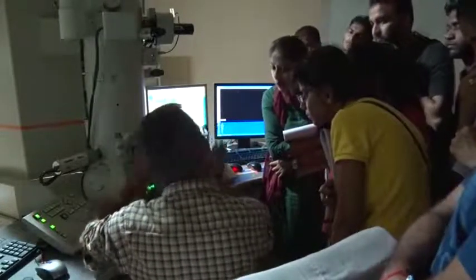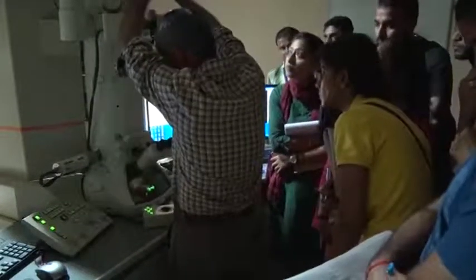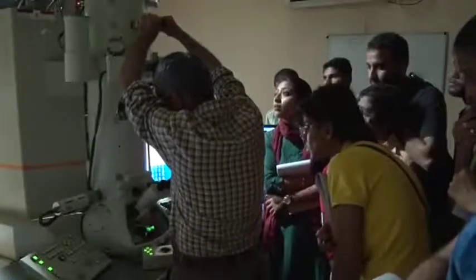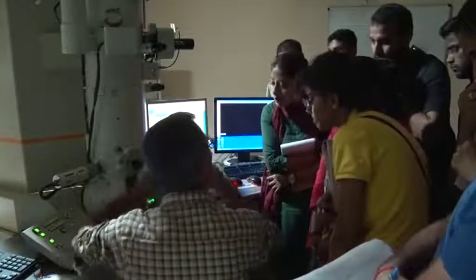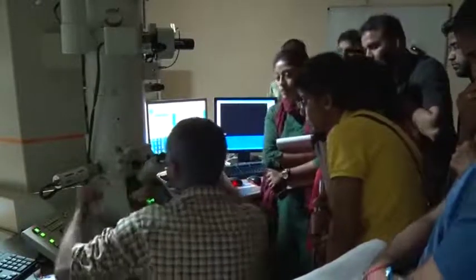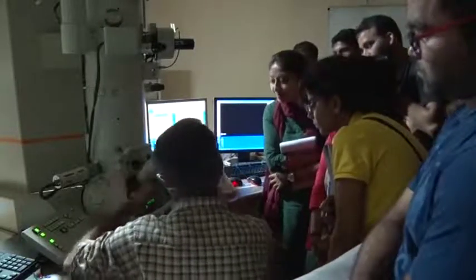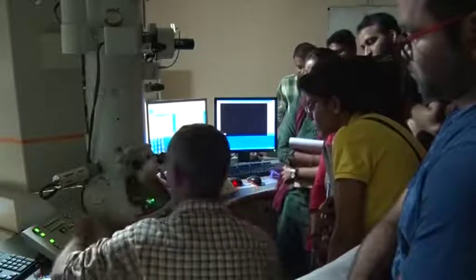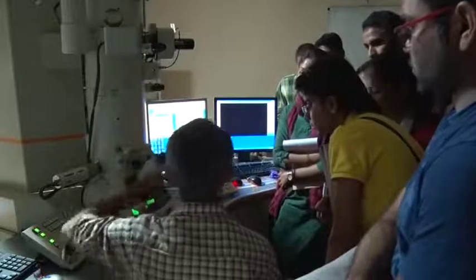In 2-3 iterations, things become more or less auditable. So I will make some correction. I would assume that now this should be fine. There is a little bit of shift that always happens. That's why this step is so commonly used, so one has to keep on doing it whenever we are operating the microscope. It is something one should constantly keep doing. That's not a problem. So now our condenser aperture is aligned. So two steps we have done.